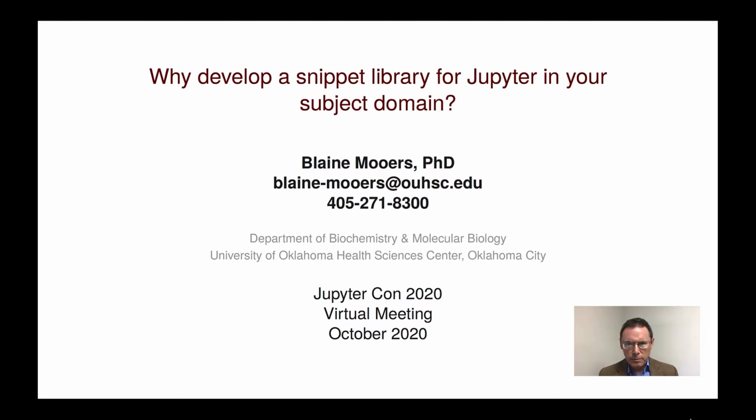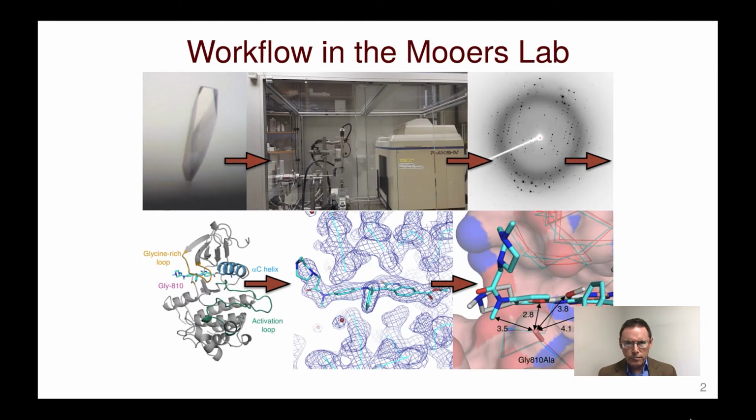I'll introduce PyMOL and the nature of snippets, and then I'll demonstrate the use of the snippet library in a Jupyter notebook using Jupyter Lab. This slide shows the workflow in my laboratory.